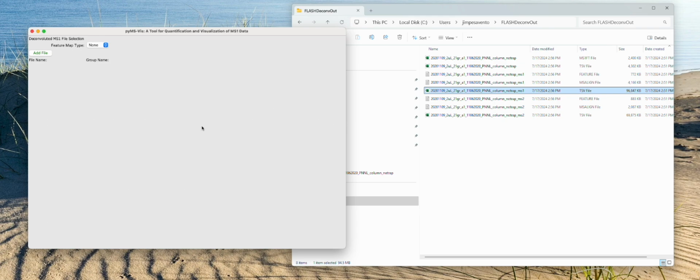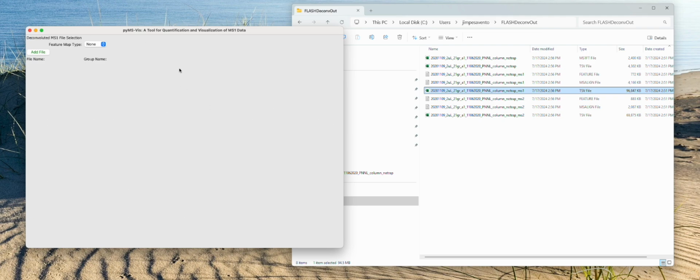You'll need Bokeh. You will need matplotlib. You will need NumPy, pandas. All this is explained in the manuscript and also talked about a little bit more in the supplemental. So that when you get it running, it should give you this screen.